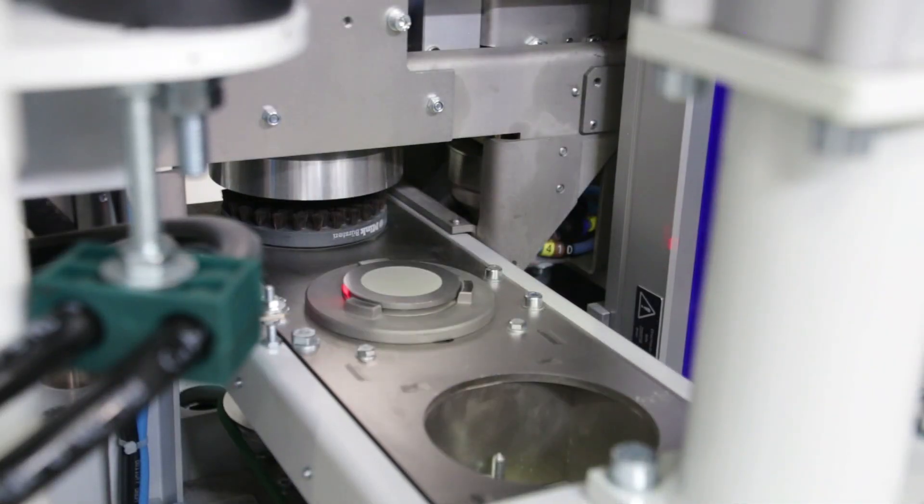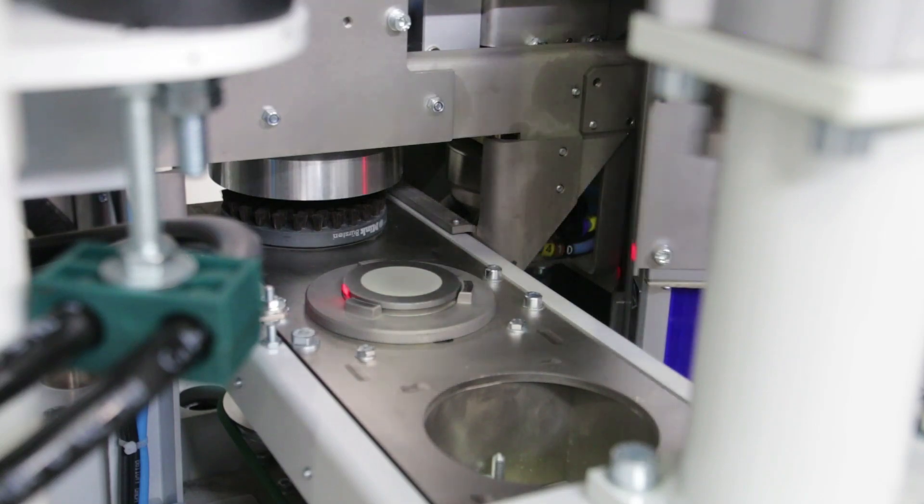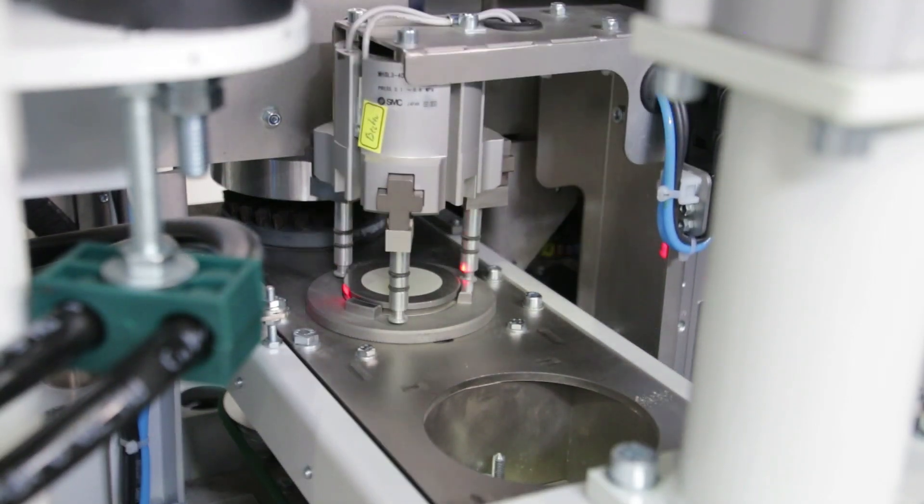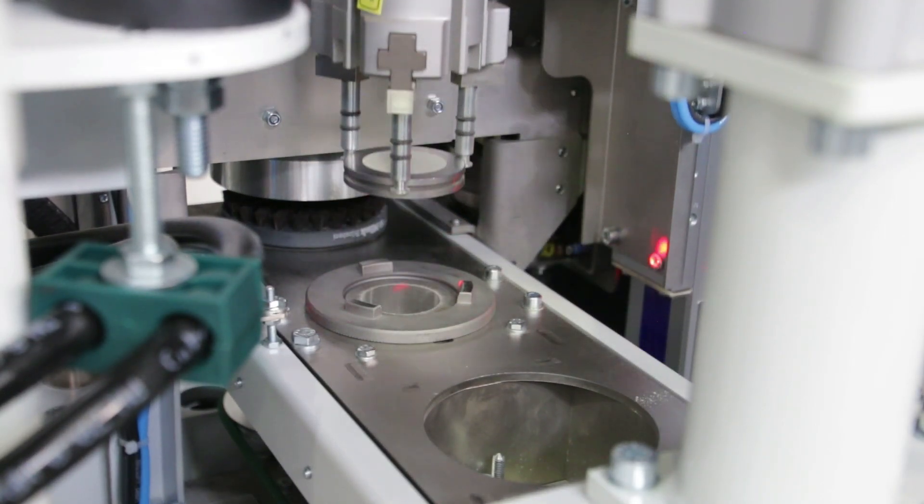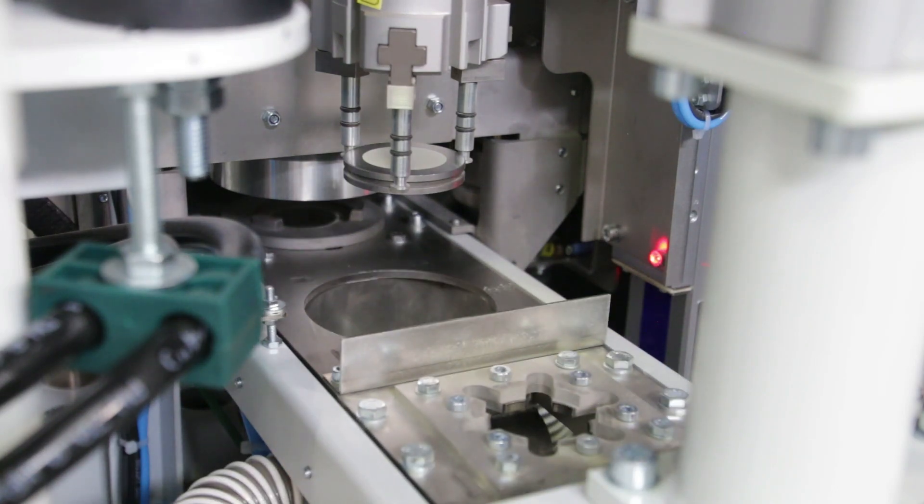With the HPMP, you achieve highly accurate and precise analytical results for X-ray fluorescence spectroscopy and diffractometry.